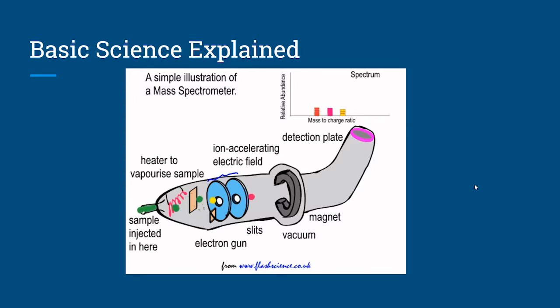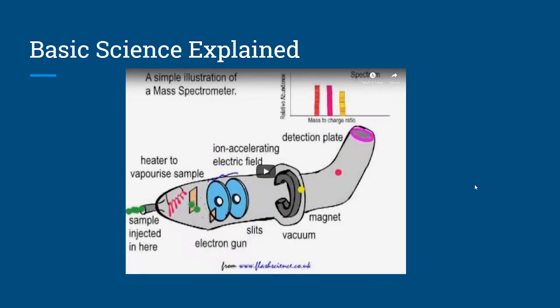After these steps happen, an electrical detector records the data from the spectrum that is produced, illustrating how many ions were categorized according to the mass and electrical charge.